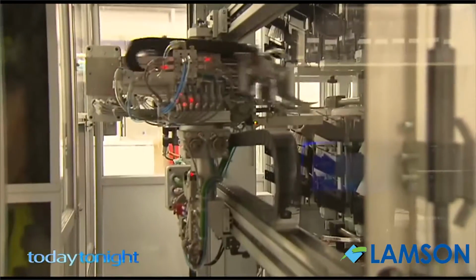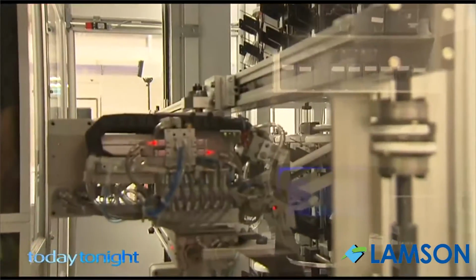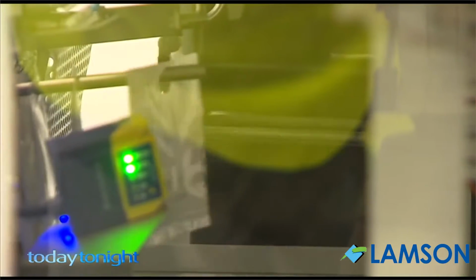This machine is what they call the unit dose robot. It prepares single doses of medication for children and barcodes them to ensure the young patients get the exact dose of the right medication. The idea is that every dose is recorded and tracked to ensure nothing goes wrong. We know that in Australia, 20% of healthcare-related errors are associated with medication, and something that we're striving to achieve here is to improve that and provide a safe environment for our patients.